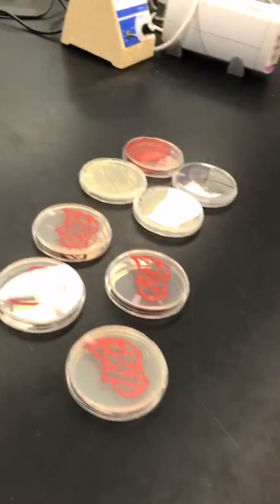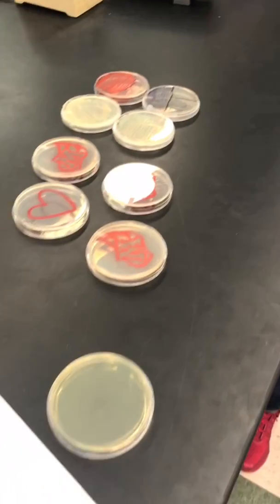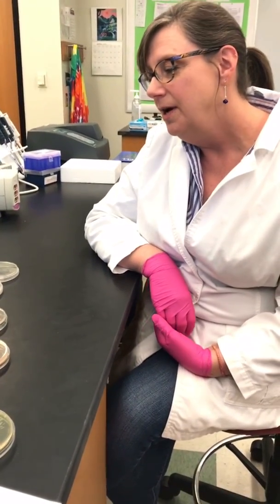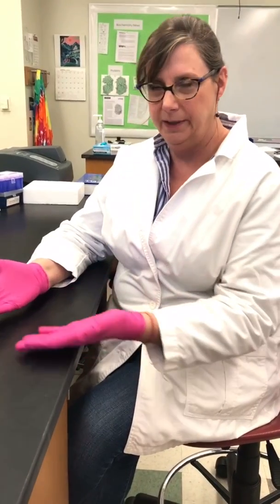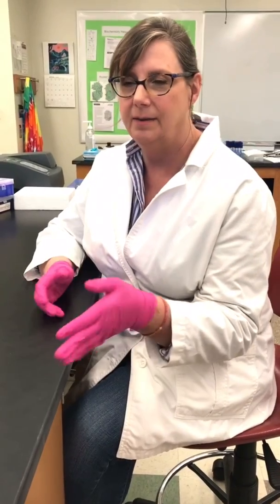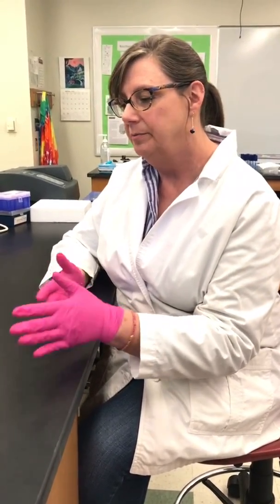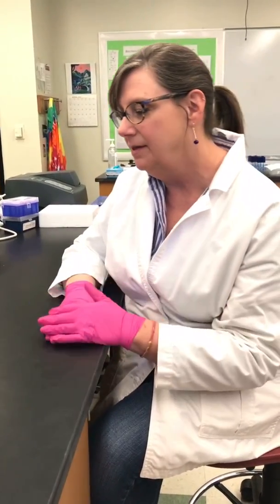All right, that's very cool. So do you want to briefly explain the process of Agar Art before we get started? Sure. So Agar Art is really fun, and it's kind of this funny thing that a lot of us who work at the bench do, and a lot of us who teach in labs will give plates of bacteria to our students that we want them to streak from, but a lot of times to make it even more fancy for class, we will design these little hearts for Valentine's Day, or a baseball for baseball season, or whatever.